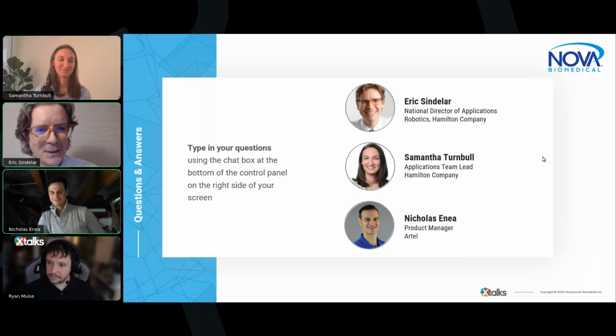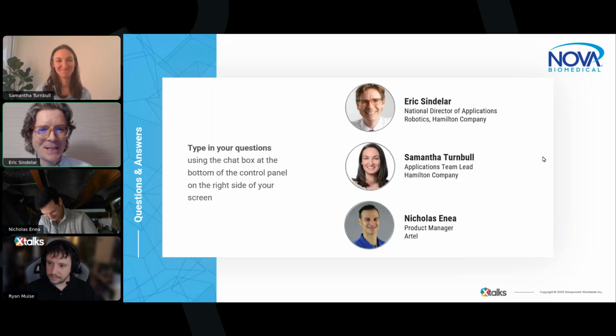I can take that one, but my answer is going to start with it depends. It depends on exactly what you're doing. So if you're seeing hanging droplets, you're probably going to need an air transport volume or a leading air gap to help accommodate that. If you have too much residual liquid being left inside the tip, you're probably going to have to implement a blowout volume of air. So it really is dependent on the context in which you're utilizing these steps, to focus on which parameter of interest. Definitely, flow rate, as we saw demonstrated in the videos today, is an absolutely critical parameter.